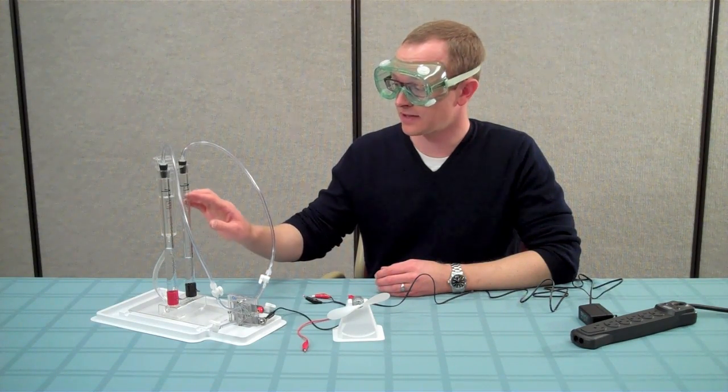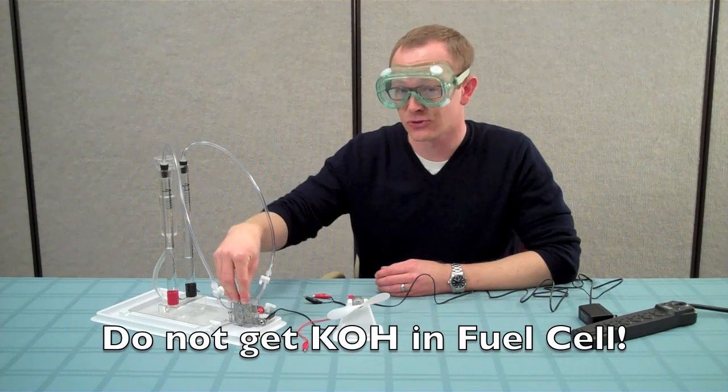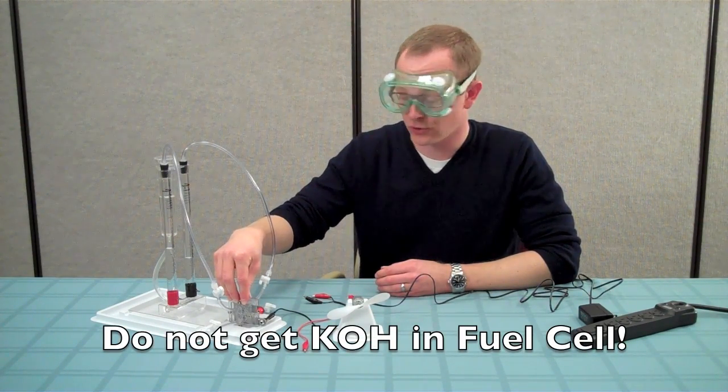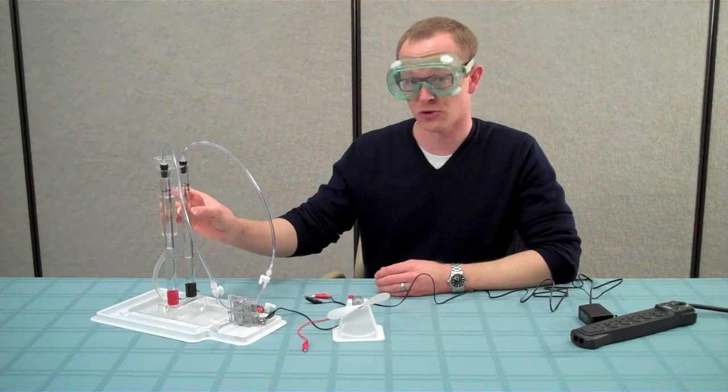If it were to rise up and get into the gas supply tubes and down into the fuel cell, it will destroy the fuel cell. So, if the level of liquid potassium hydroxide rises above the zero mark, what you want to do is close both gas supply valves.